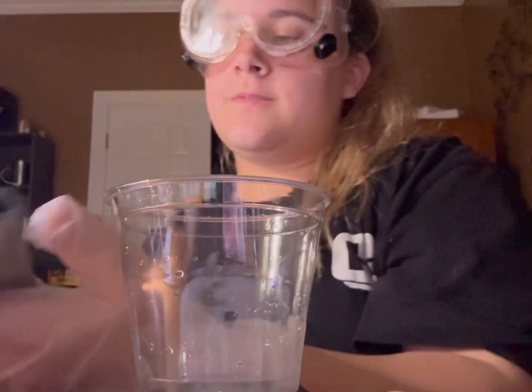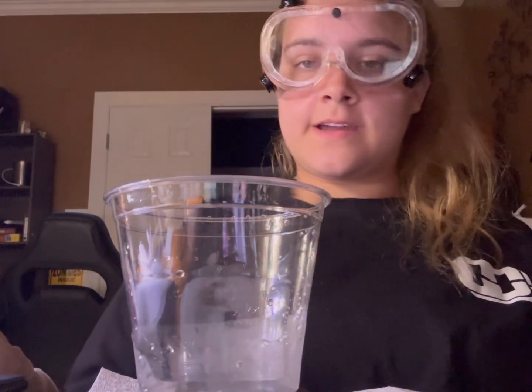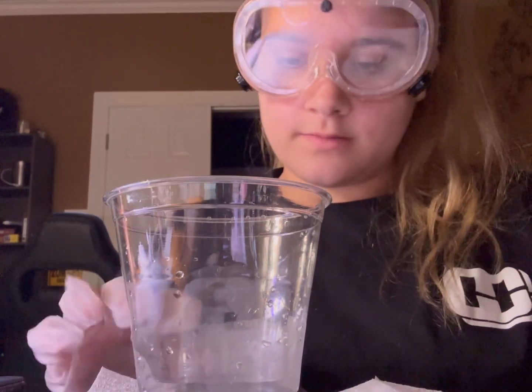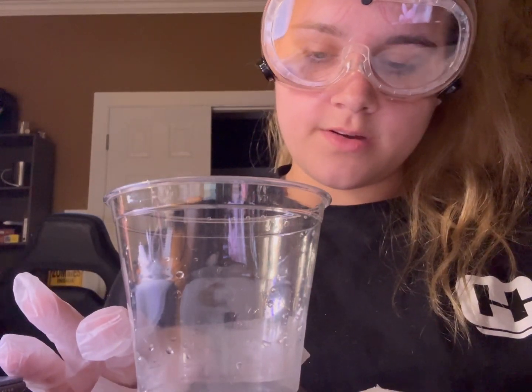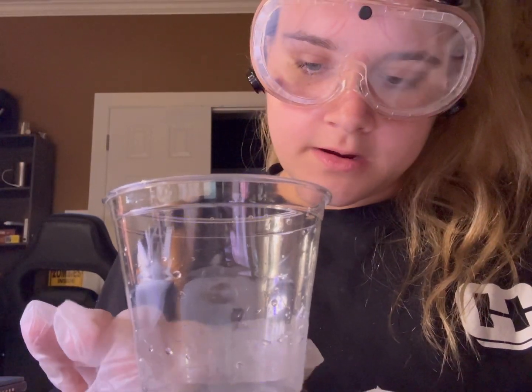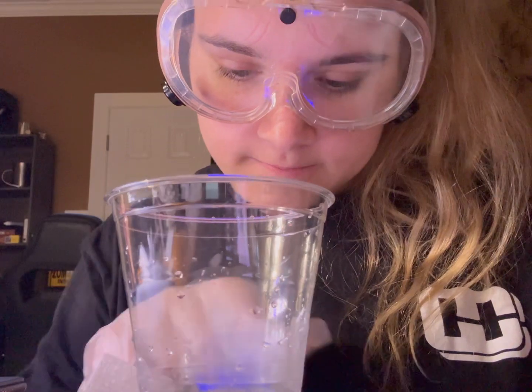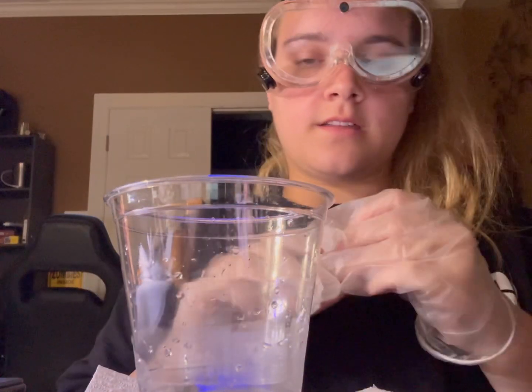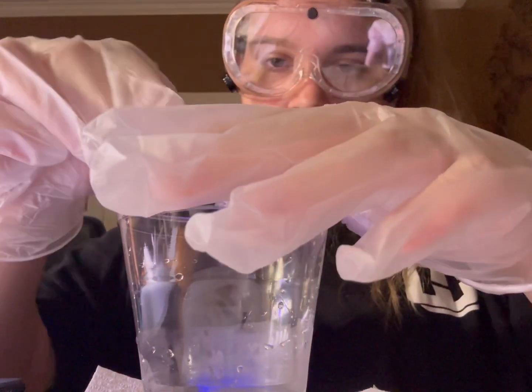And now we're moving on to 0.5 teaspoons of salt. So let's weigh 100 grams of ice in this cup here again. Alright, so 100 grams.